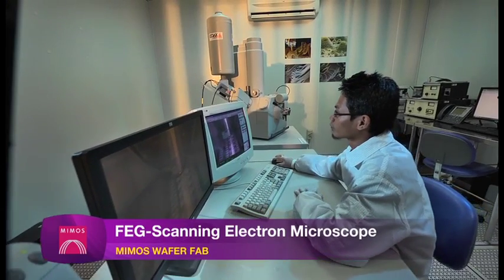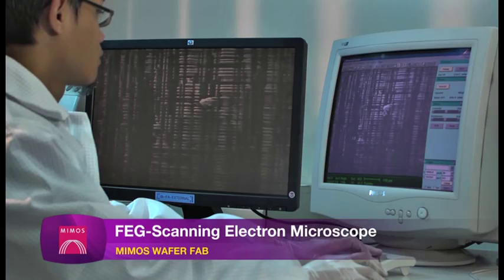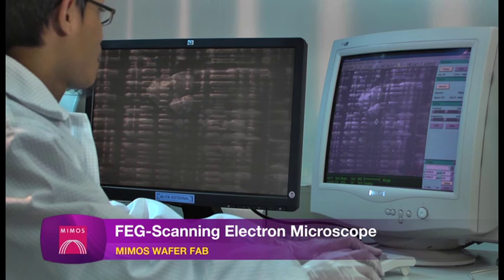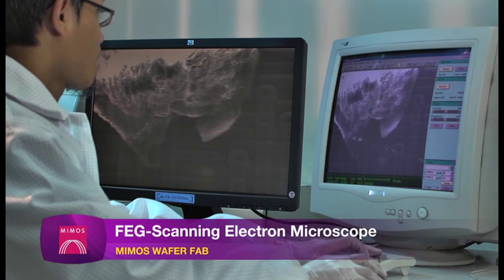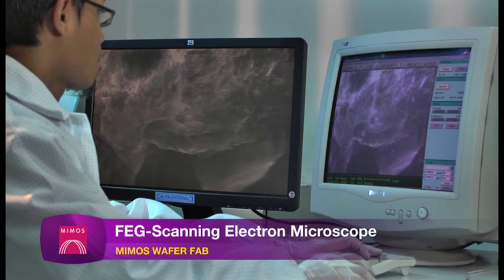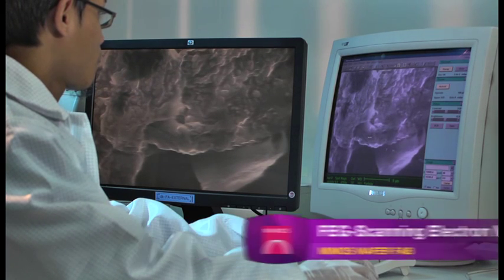FEG Scanning Electron Microscope is an ultra-high resolution inspecting system. It is able to reveal topography or texture and morphology or the shape and size of samples at very high magnifications.